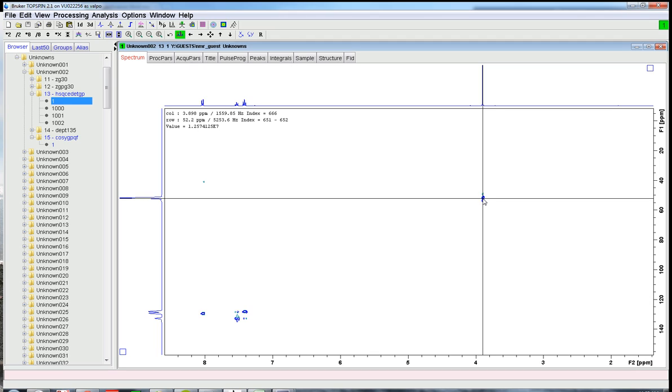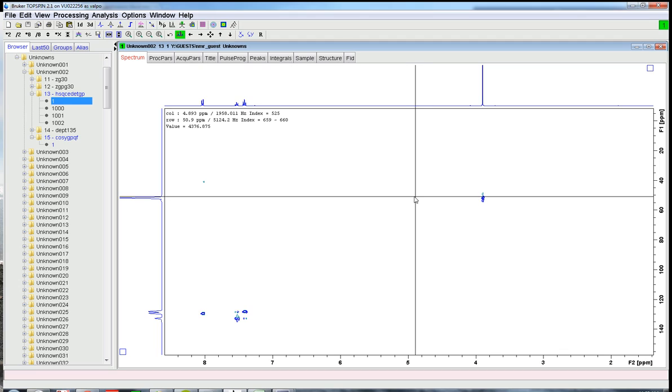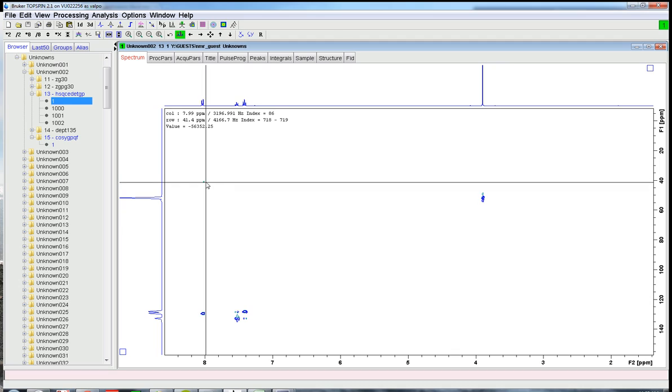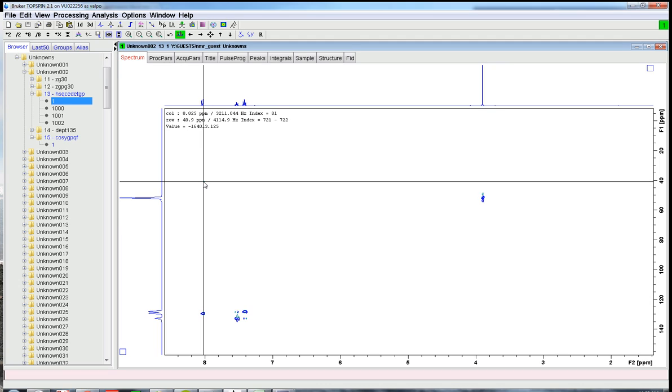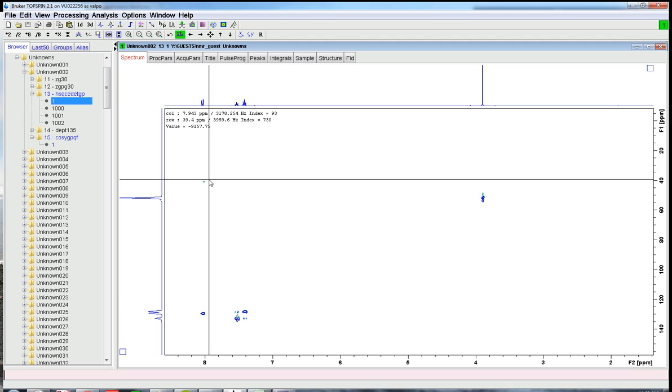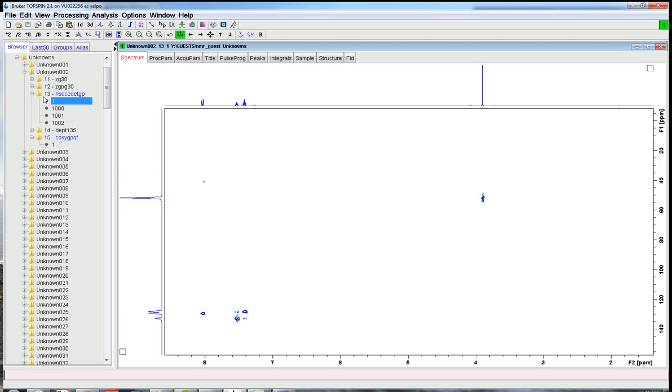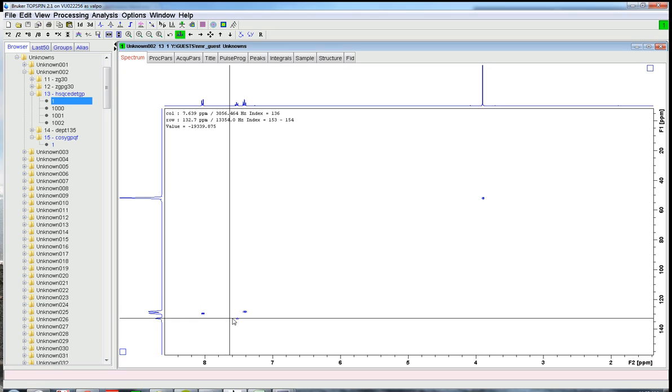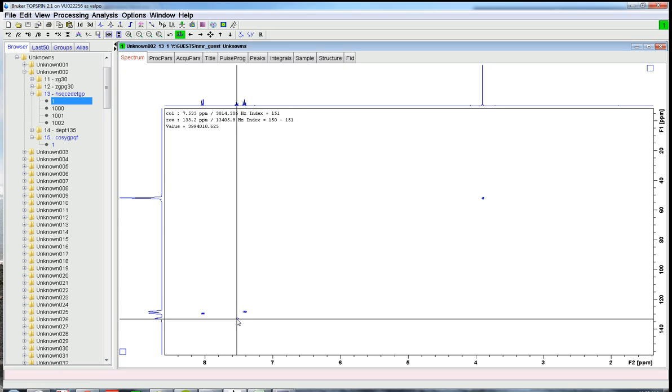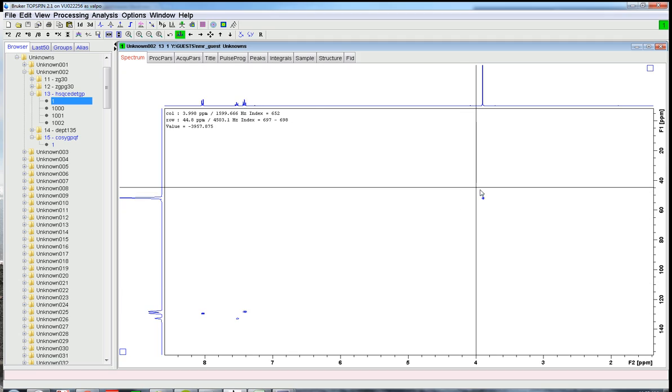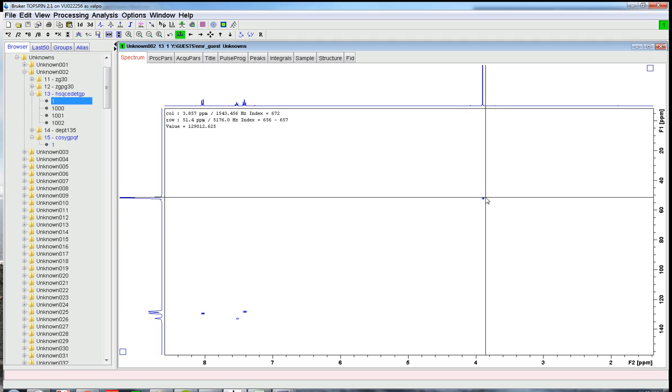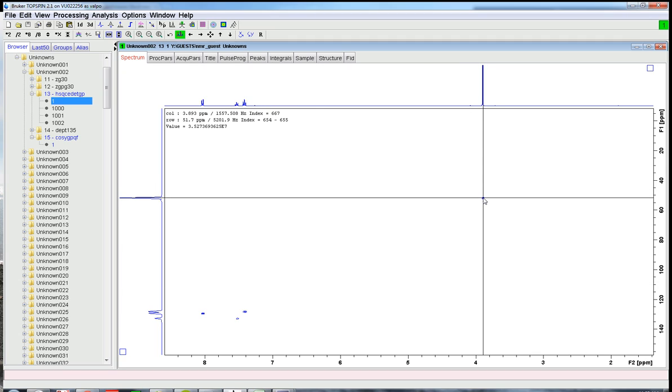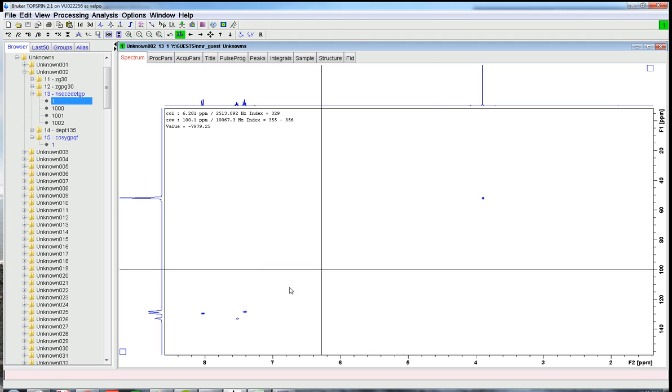Just like with the COSY, we need to reduce the intensity a little bit. So we get rid of these little cross peaks that are just noise, right? There's nothing there on the carbon axis. It's just noise. So you can click divide by 2. And you can get down to the point where you see that they're pretty small peaks, but you don't have anything else. And there should be a proton peak on the x-axis that lines up with a carbon peak on the y-axis.